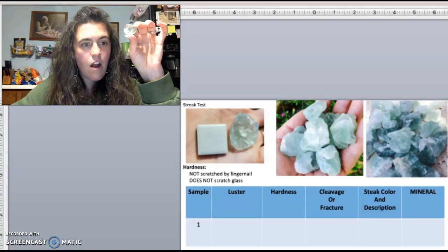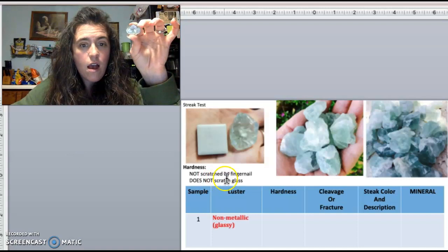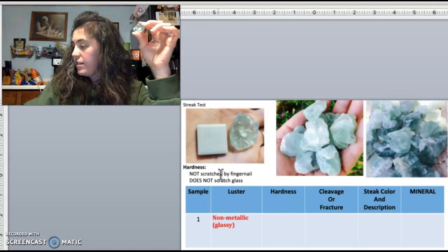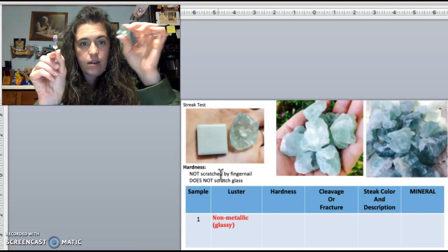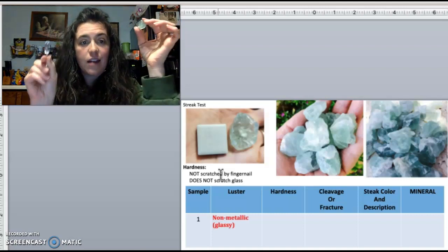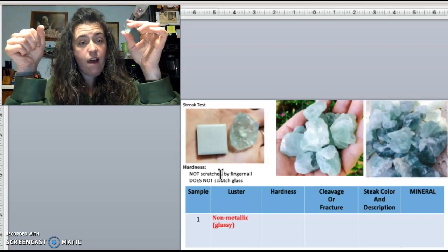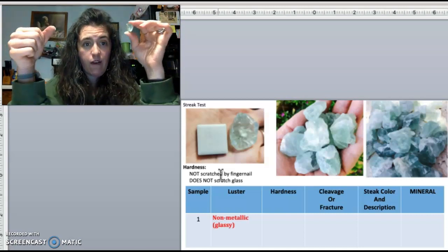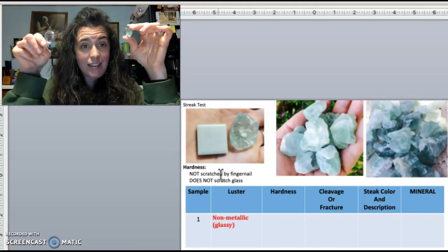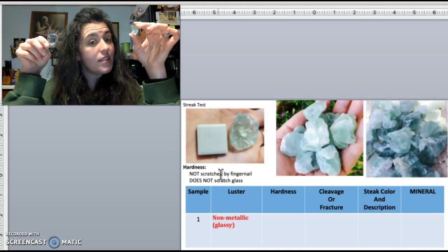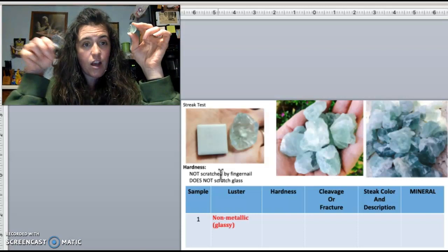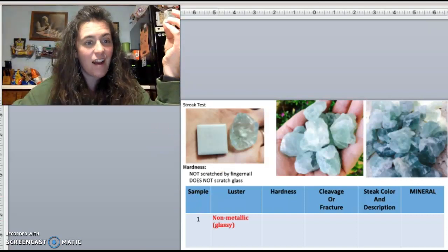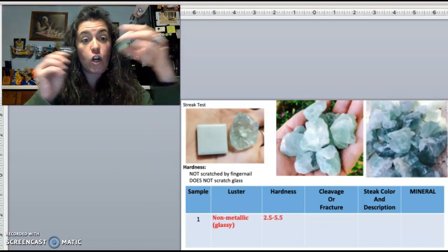Next, let's look at hardness. My fingernail does not scratch it — my fingernail is 2.5 — so it must be harder than 2.5. Then I try the glass, which is 5.5, and this does not scratch glass, so it has to be greater than 2.5 but less than 5.5. We're doing relative hardness using our known amounts.